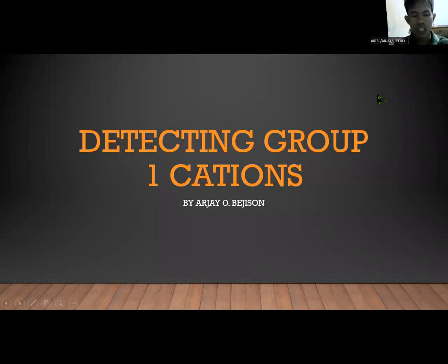Hello, everyone. Today we're going to talk about detecting group 1 cations. There are 5 groups involved in cations, but today we are just going to talk about the group 1 cations. So how do we detect the elements involved in group 1 cations, and what are the elements that are involved in it?